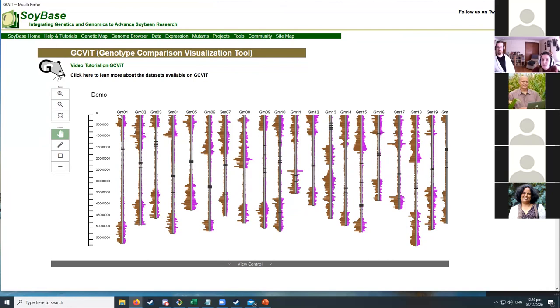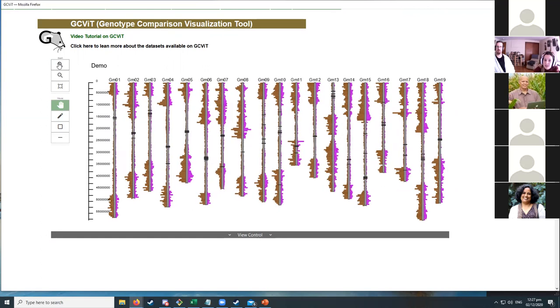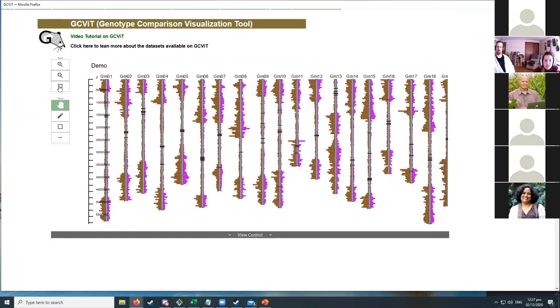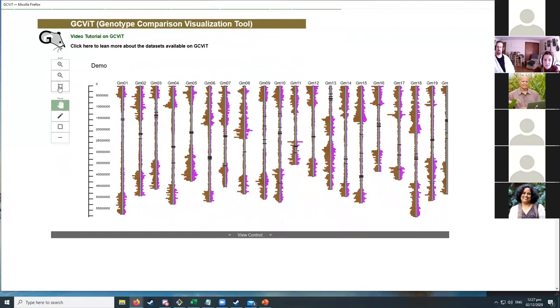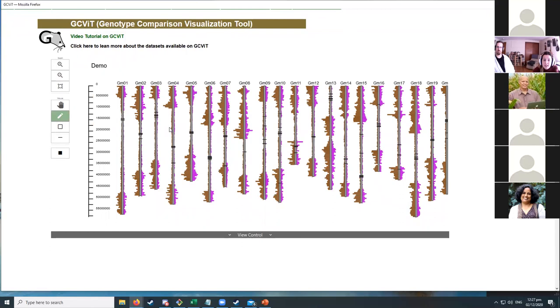A key indicates what brown and pink represent: the total number of SNPs is shown in brown, and the differences between G. soja and Williams 82 are shown in pink. Black boxes represent centromeric regions. The tool is interactive — users can zoom in, zoom out, return to the full view, scroll around, and move the display.